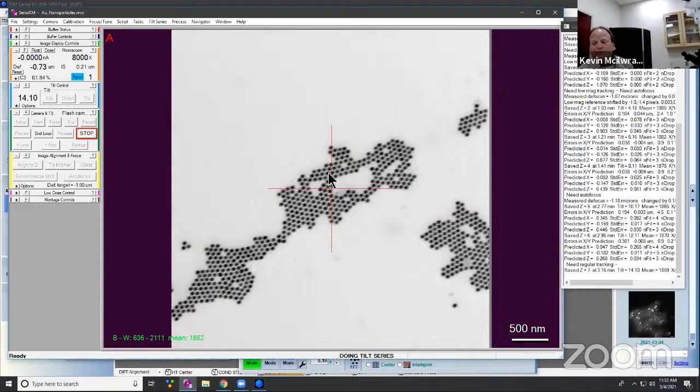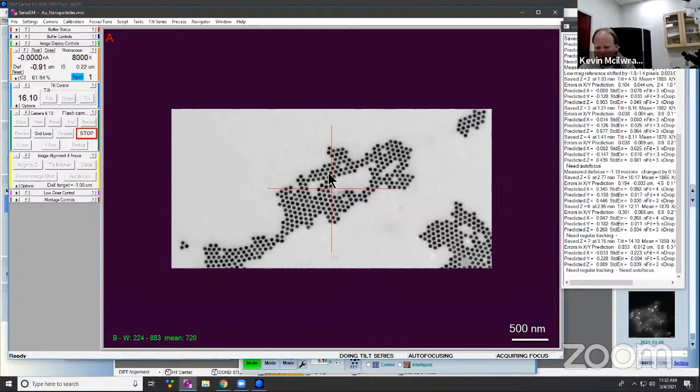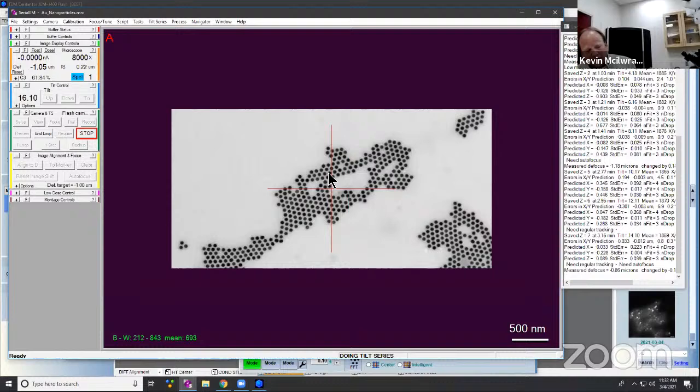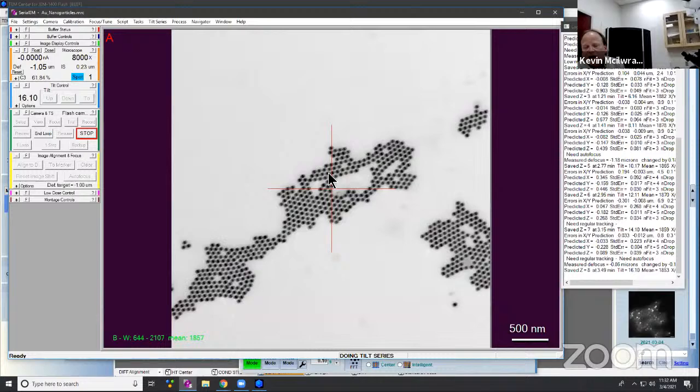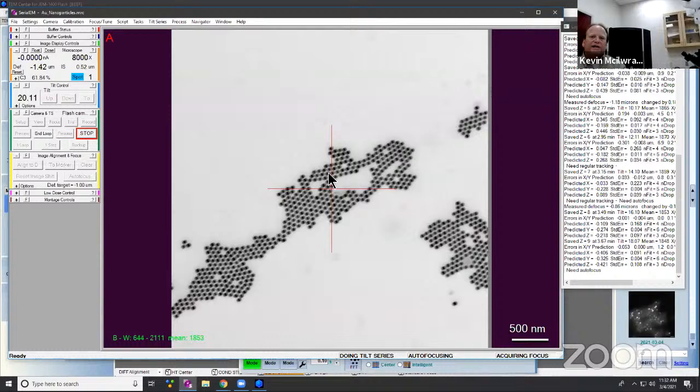Now, Hitachi's got a linear actuated stage. It's nice and pretty precise, but at low mags, it just goes and moves. You can hear it screaming as it moves around. And then their stages are jewel tips. So their stage mates with a beryllium cup, whereas us at Thermo, we're just cantilevered out, which gives us more flexibility in building stages that are thinner and stuff. You don't have that pressure.